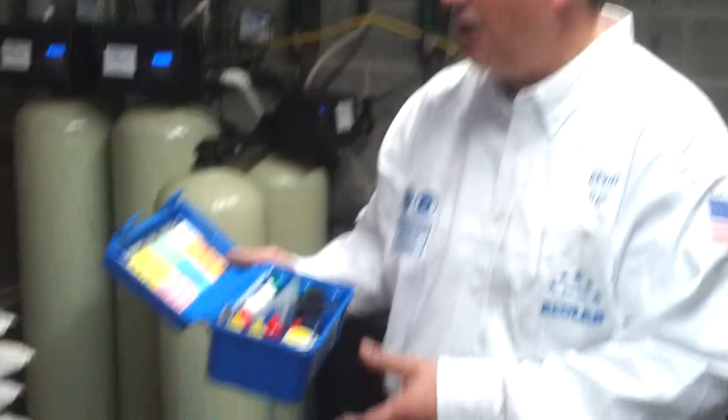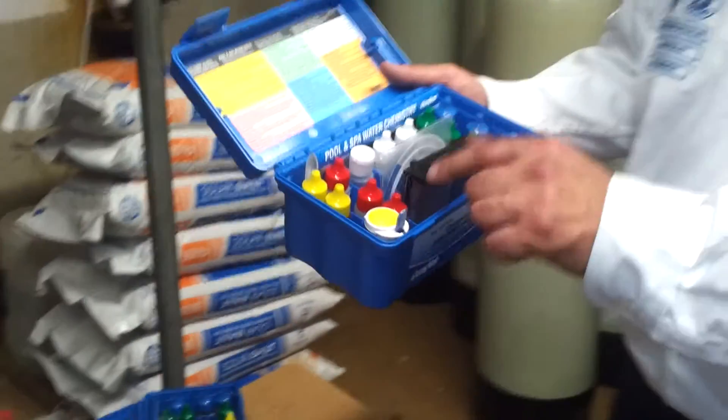The test we're going to go over right now is the free chlorine test using the yellow bottles. This is going to indicate to us how much active chlorine we have in the water.